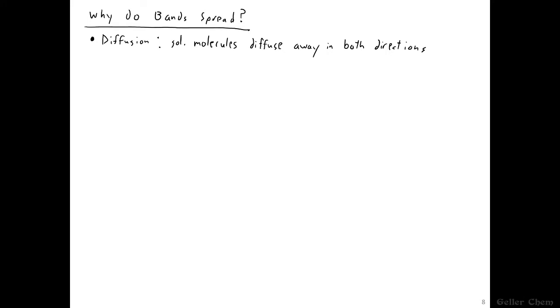This is specifically called longitudinal diffusion, but we don't need to know that. The more time it spends in the column, the more diffusion occurs.